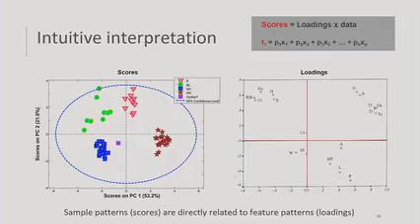You should get really similar results compared to your t-test. So like if you see a PCA plot and you have all your control and your treated here, and then you see the loadings that are pushing in those directions, they should be really similar to the ones that are in your t-test results because they're both linear methods. But the nice thing about this is that it groups them together. So you can see like all the group of the features in the top left corner, those probably have correlated abundance levels, and that's why they're pushing in the same direction.